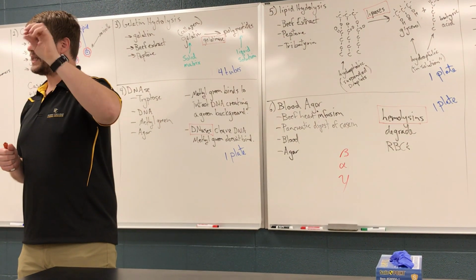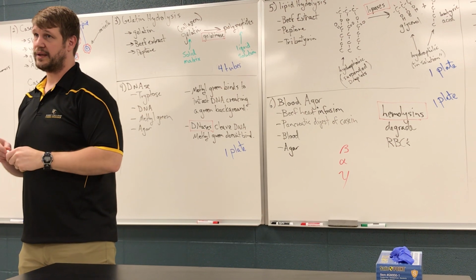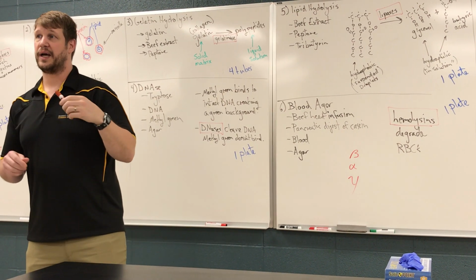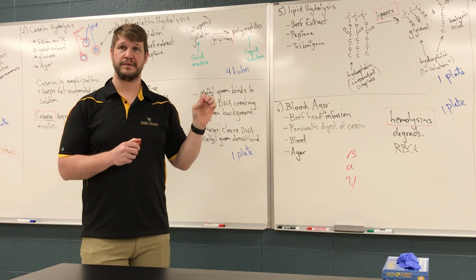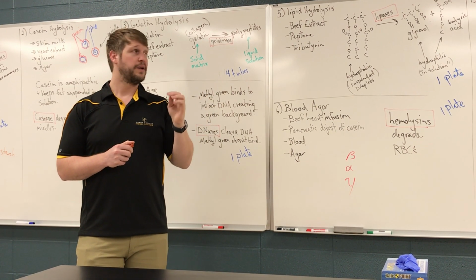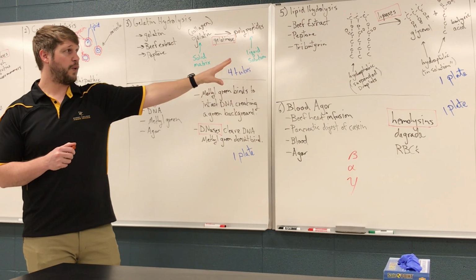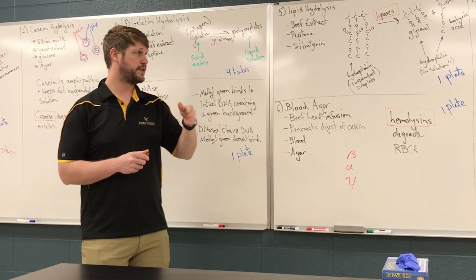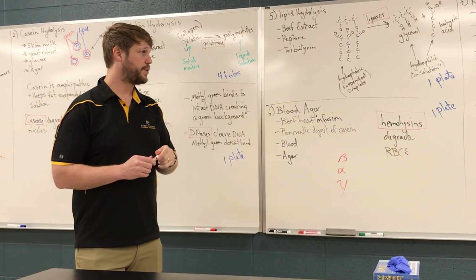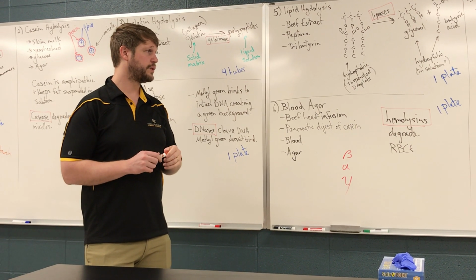So you should be able to see in the vicinity of the inoculation, again, a clearing of these little fat droplets. Okay? So you can do one plate, again, for all 4 of your microorganisms. Just divide it into quadrants. Keep track of which one is which.